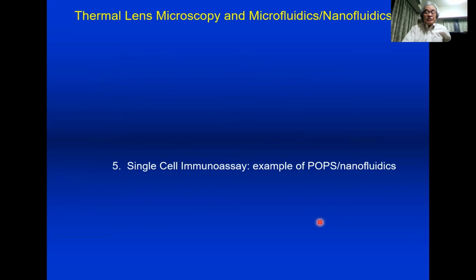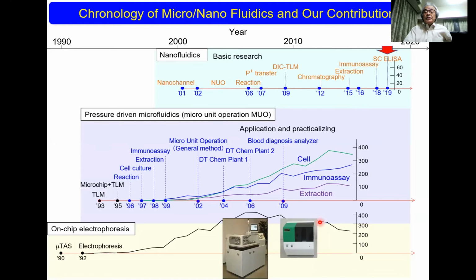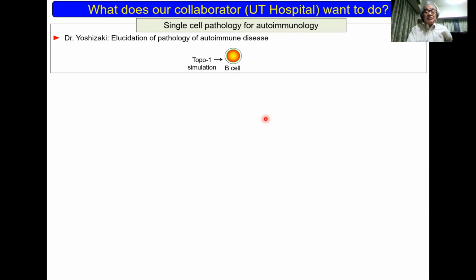And then I'd like to introduce how to use this one. The example is a single cell analysis. I'd like to hurry up. So the experiment is like this way.